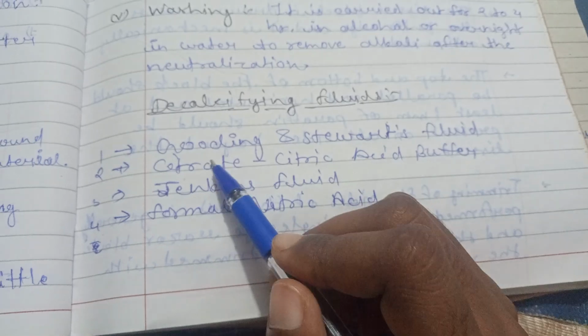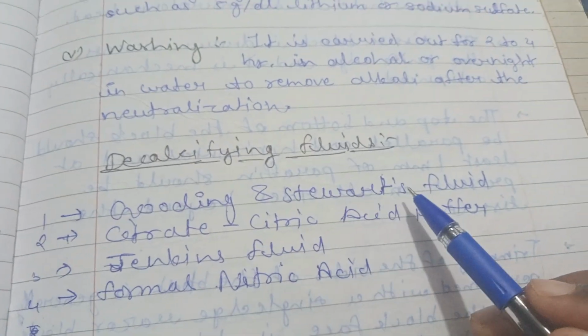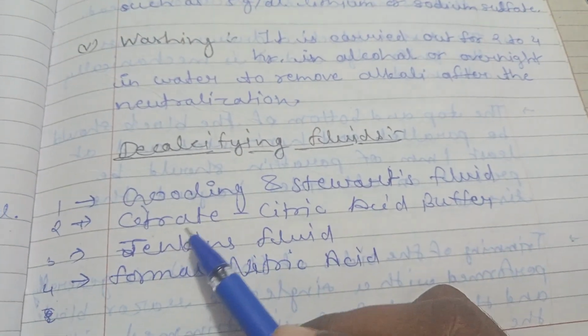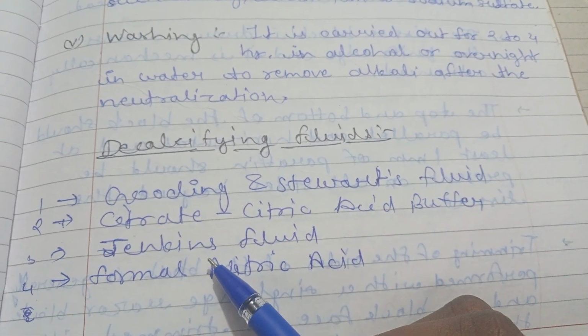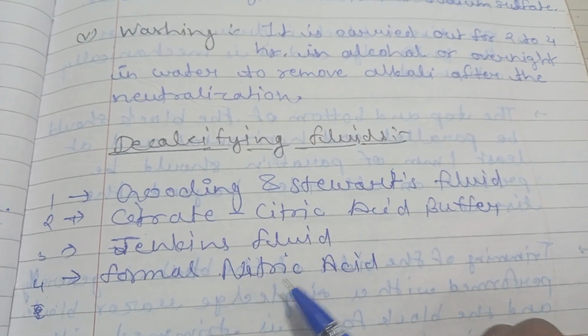Decalcification fluid: Gooding and Stewart's fluid, citric acid buffer, Jenkins fluid, formal nitric acid.